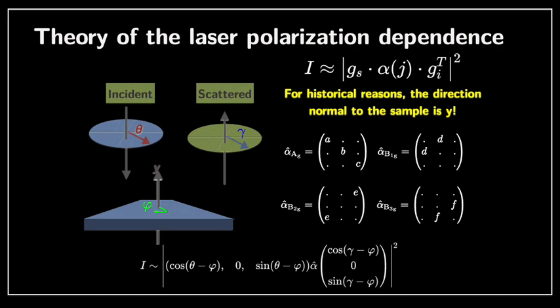So remember, GS is the scattered light, GI is the incoming light. Again, this is the direction of the electric field. And you see here that indeed the dot product is obtained. I wrote it explicitly on the bottom of this slide. So again, this is a good place maybe to pause the playing of this screencast so that you can maybe convince yourself.